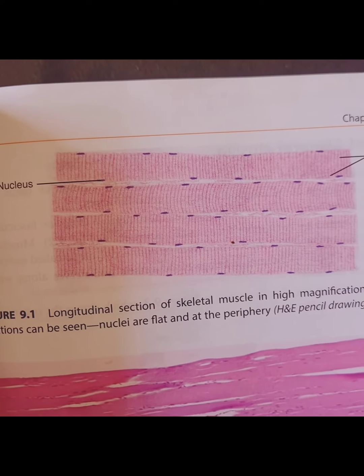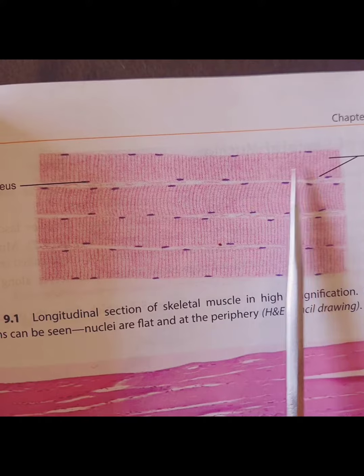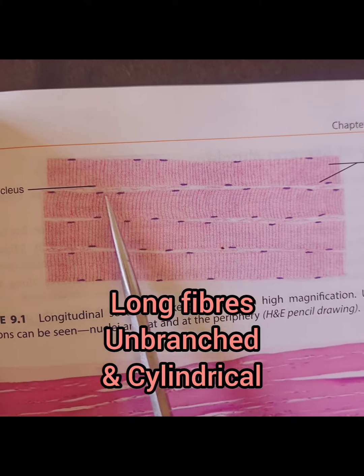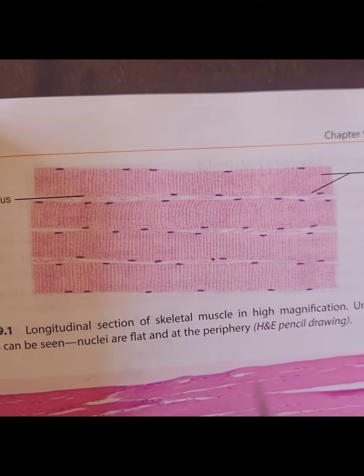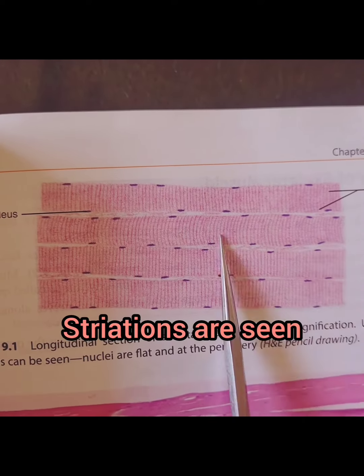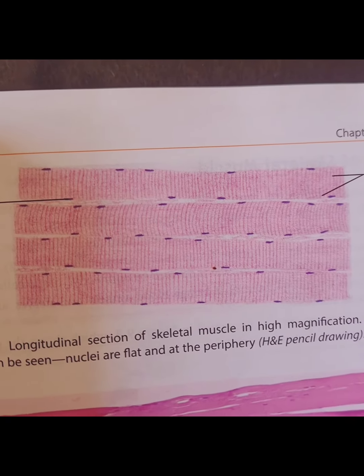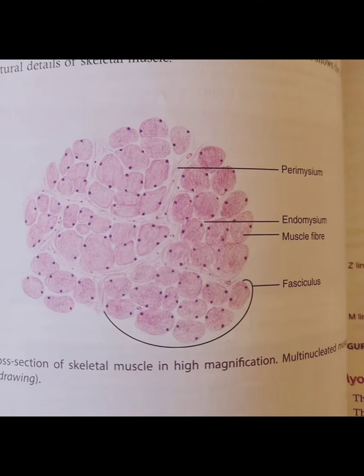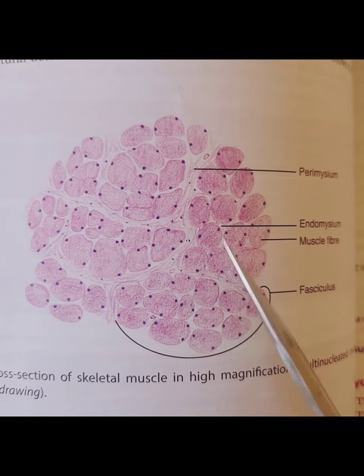Histology of skeletal muscle show long, unbranched cylindrical fibers. Nuclei are multiple. They are placed peripherally in the muscle fiber and flat. There are evident striations which are seen because of actin and myosin filaments inside the muscle fiber which are arranged within myofibrils. This is transverse section of skeletal muscle which are arranged in different fascicle.